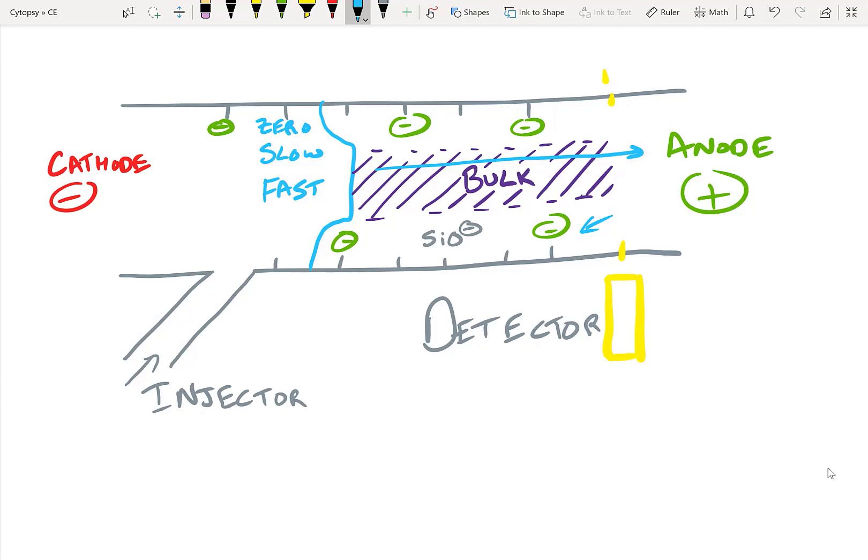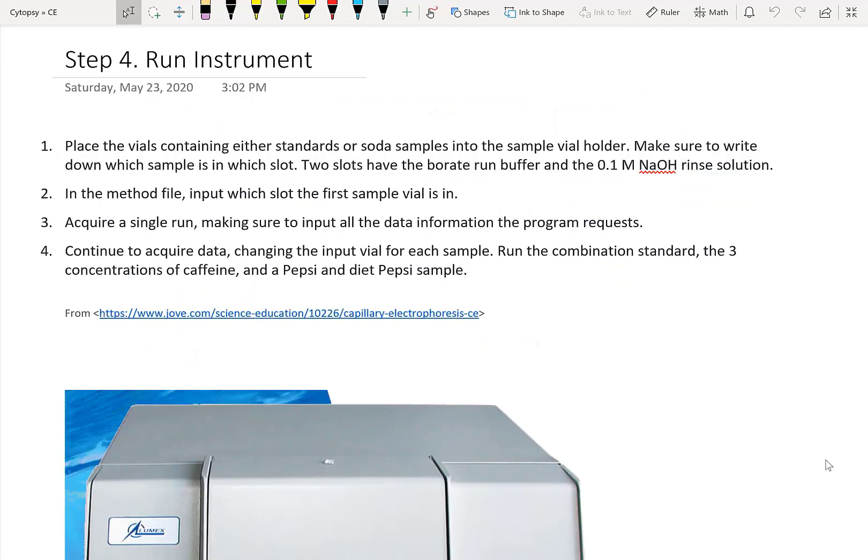And in this protocol, we're running normal polarity capillary electrophoresis. Here's the fourth step in the JOVE protocol. And you can see there's nothing much noteworthy here. You're going to have multiple sets of samples. So in this case, we're going to be running some soda samples - remember diet versus non-diet Pepsi. And also we're going to have borate run buffer and sodium hydroxide rinse solution as some of the inputs, because we're going to be rinsing our capillary in between each of the runs. That's about it.